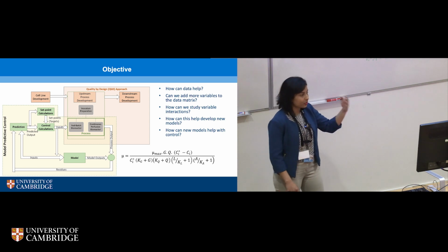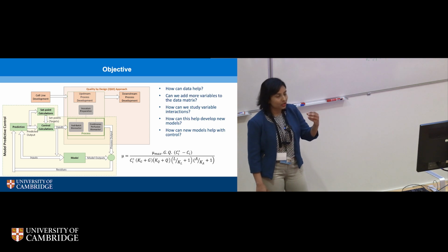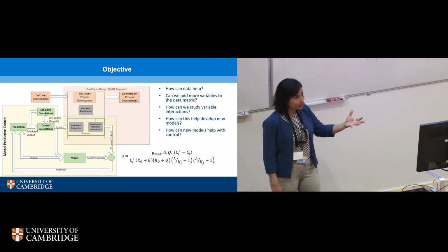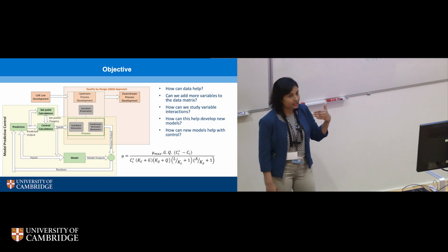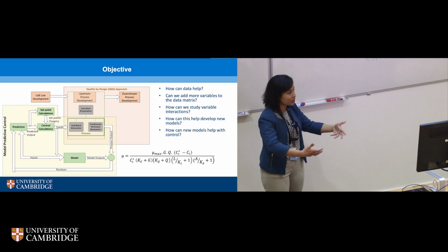They appear in the equations over and over again, but they really don't provide a lot of controllability. The main reason is that you can add a lot of glucose, which will give you a boost of cell growth in the initial part, but it causes accumulation of lactate towards the end, which means it's not a good control strategy. In addition, if you add a lot of glutamine, a lot of ammonia will build up, which is again a toxic byproduct.